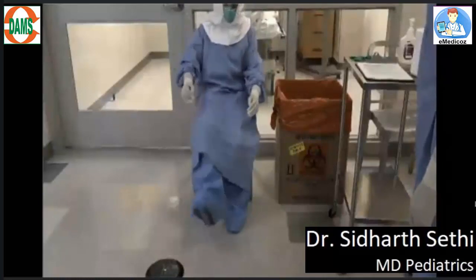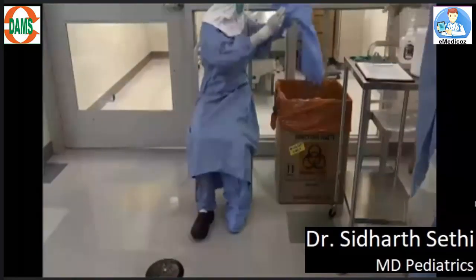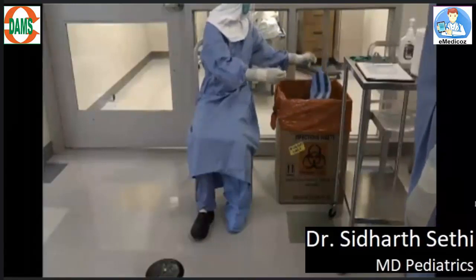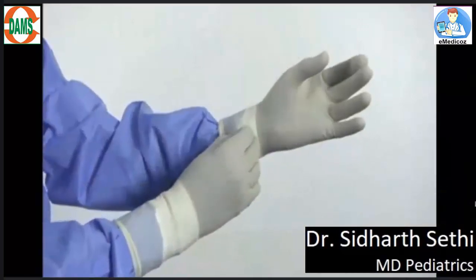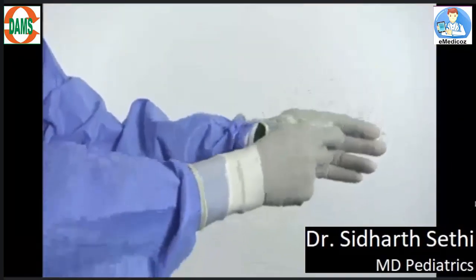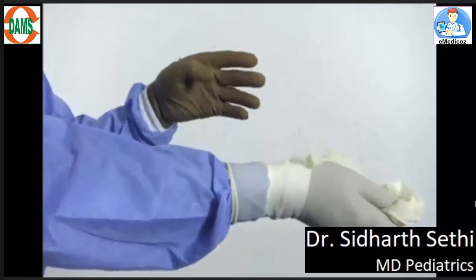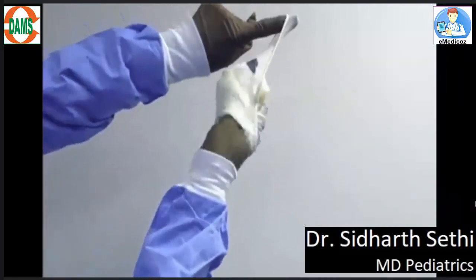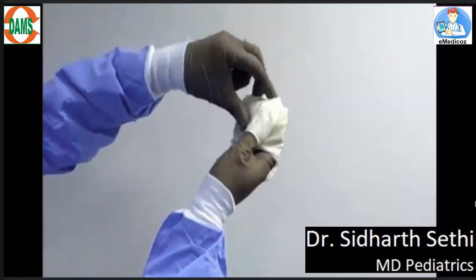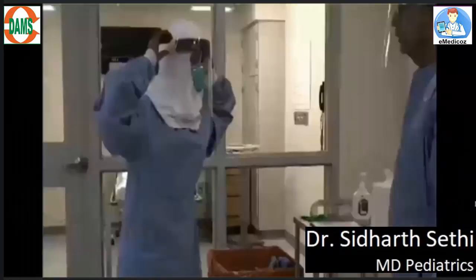Now sit down on the designated dirty chair. Remove the shoe covers carefully, one at a time, and throw them in the infectious waste container. Again clean your gloves. Remove your outer gloves by pulling from the exterior side of the gloves. Hold the removed glove in the other hand and with a single finger remove the other hand's glove — it should come off completely inside out. Now clean your inner gloves.